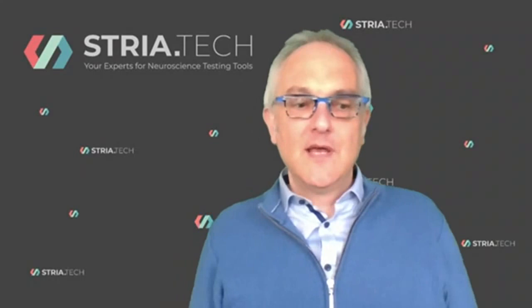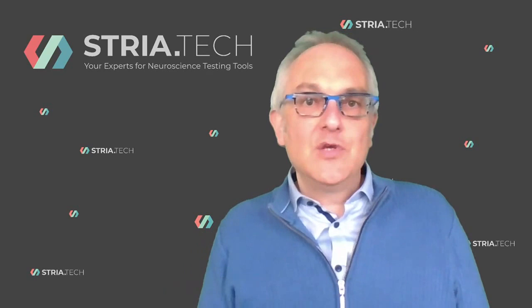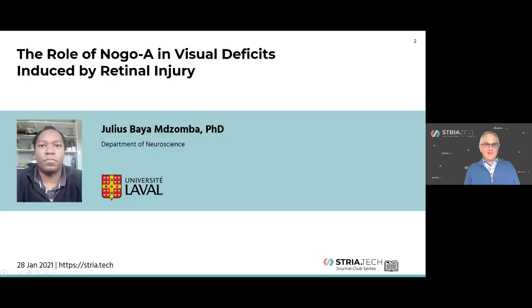In our journal club series, different scientists present projects and new data highlighting the use and the applications of our OptoDrum device. Today, it is a great pleasure for me to introduce Julius Baya Mdzomba to our journal club. Julius works at the Université Laval in Quebec in the lab of Vincent Pernay. He will talk today about the role of Nogo-A in visual deficits induced by retinal injury.